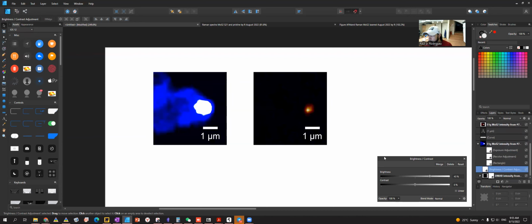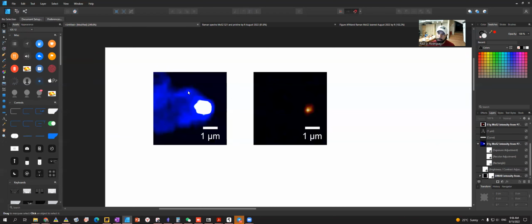Yes, there. So these changes will only affect that image. Okay, so increase a bit. What I want to know, this is saturated. I will not go to that.